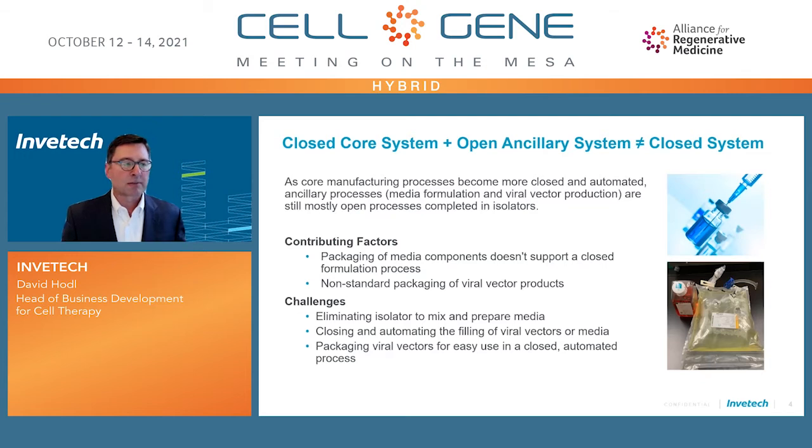Some of the challenges are eliminating the isolator to mix and prepare media, closing and automating the filling of viral vectors and media into containers that are compatible with integrated manufacturing processes, and packaging viral vectors in very easy to use packaging in a closed automated process. That means taking that viral vector suspension and aliquoting it into smaller volume bags that can then be utilized for individual transduction processes in an autologous manufacturing system.